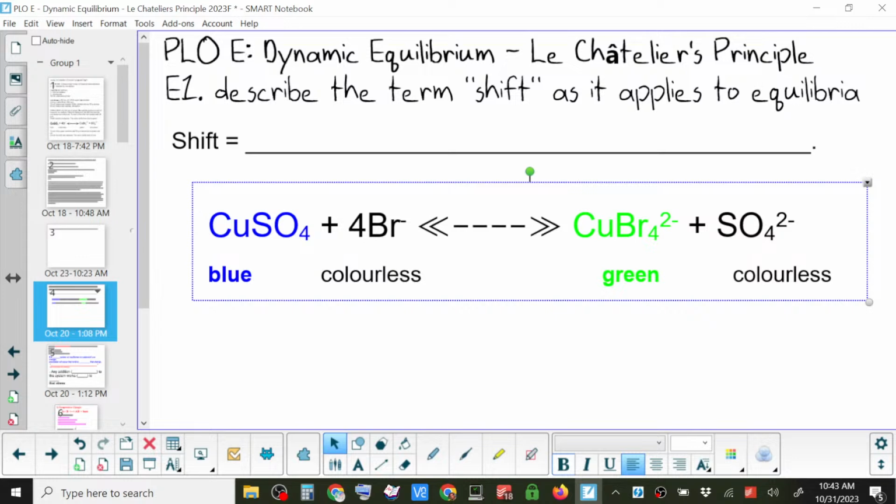Now for that one you can see it, because it's actually dissolving a little better. For the one that's dark you can't quite, but maybe I'll get you to come up. Let's try and get this all dissolved.